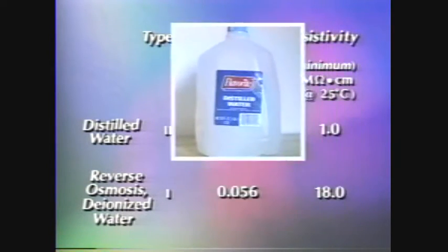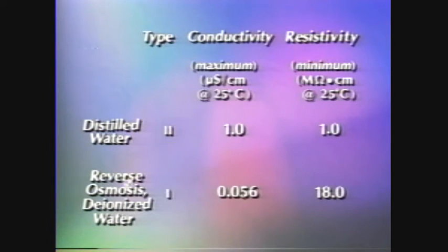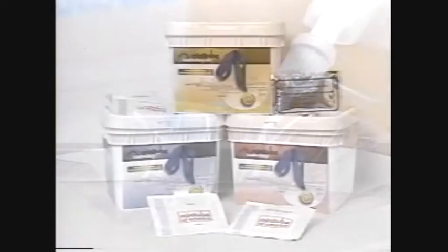Purified water can be purchased locally or produced on-site in the boar stud. The economics of purchasing versus producing purified water are dependent on the quality of the local water to be purified and the amount of purified water required. Exact details can be provided by Minitube.